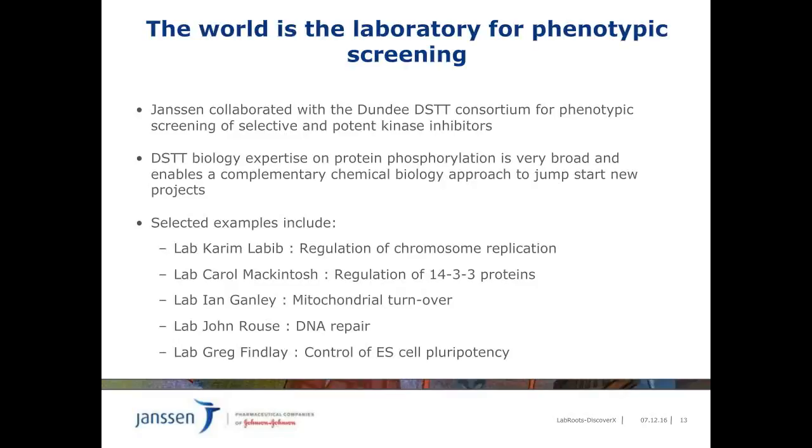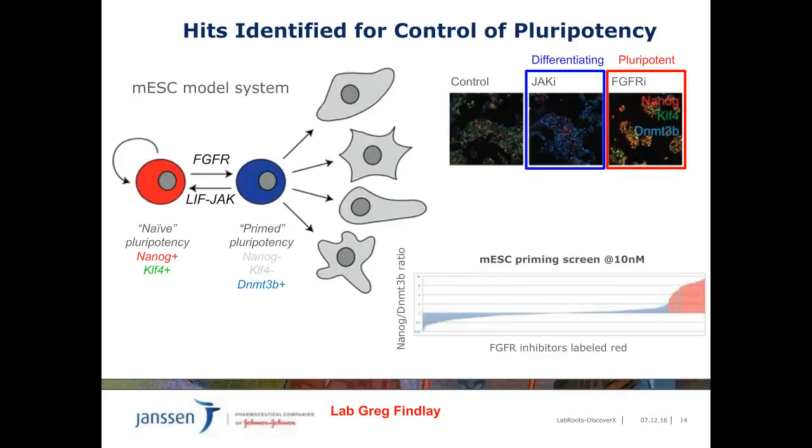The next project I will report on is the phenotypic screening of our kinase inhibitor set we did with the Dundee DSTT consortium. We screened our selective and potent kinase inhibitor set on typical phenotypic assays running in Dundee DSTT biology labs, and one assay in collaboration with Greg Findlay will be highlighted. The assay is exploring the control of embryonic stem cell pluripotency. The principle of the assay is illustrated in the following slide.